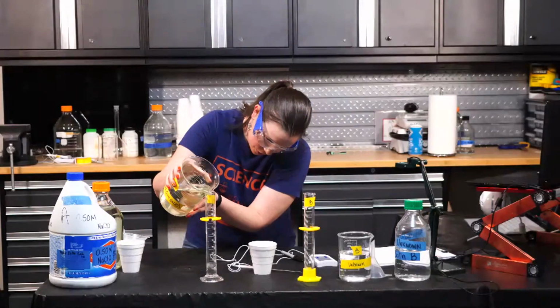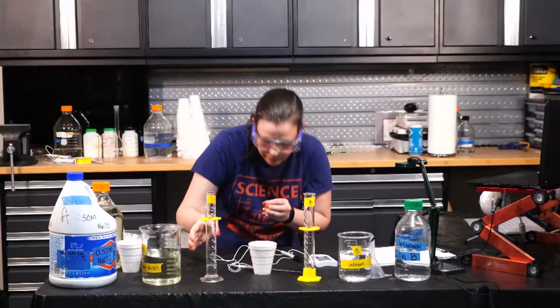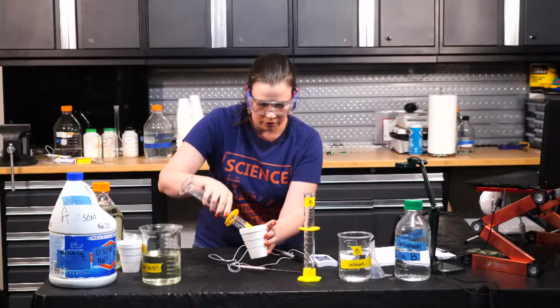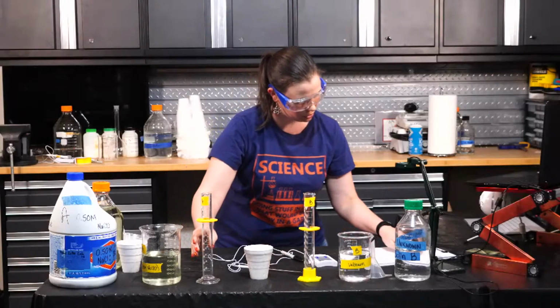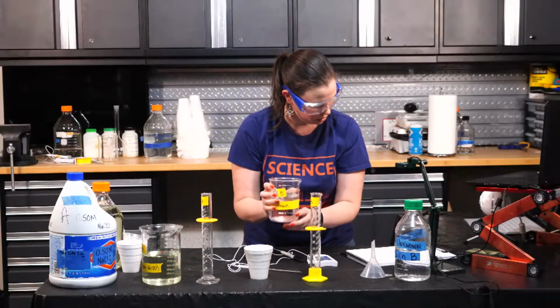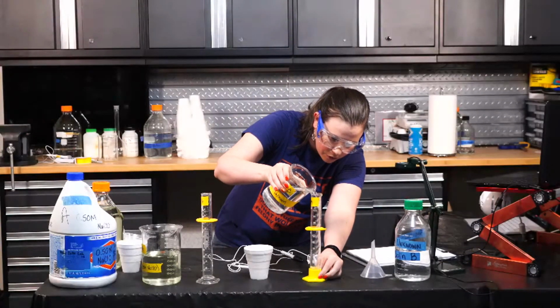And to be honest, I should really measure 15 milliliters in a 25 milliliter graduated cylinder, but I don't have that. So here's my 15 milliliters of bleach, and I'm going to mix that with 35 milliliters of solution B for level 2.